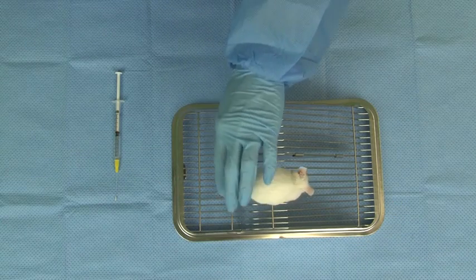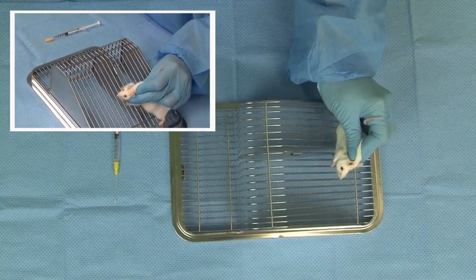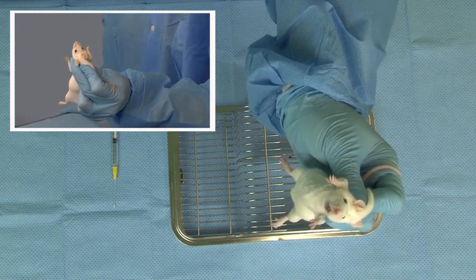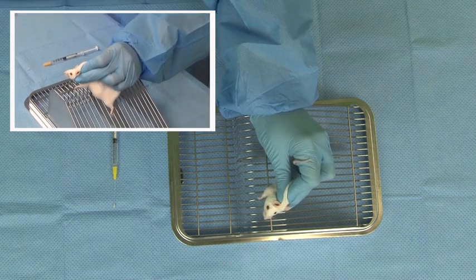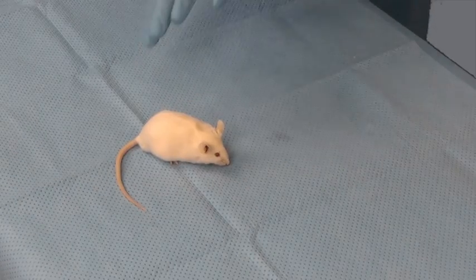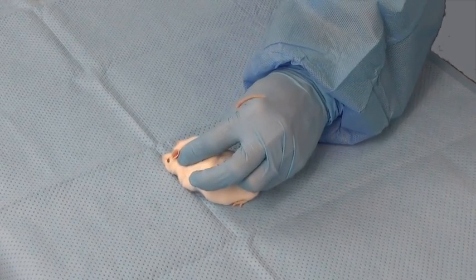Now we will address restraint of the animal. Proper restraint is the most important part of a successful gavaging procedure, critical for both the safety and comfort of the animal and safety of the technician. Gently but firmly grasp the mouse by the base of the tail, then use the thumb and index finger to gently grasp the nape of the neck, holding on to the mouse by the scruff. Then confidently lift the mouse by the scruff and hold it in an upright position, lifting the mouse off the surface so it cannot use its back legs for leverage. Here is the same restraint technique from another angle, demonstrating how the middle finger is used to stabilize the mouse's neck and head.